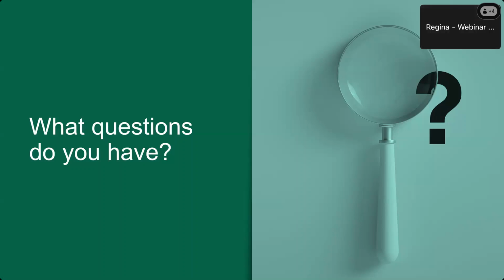Do you have any suggestions for mitigating PFAS contamination from the laboratory environment? That's a great question. We actually have a guide on our website called Mitigating PFAS Contamination in Your Lab. There is a lot of stuff, so I would urge you to go and take a look at it. I would defer to the very large white paper that we put together on the Waters site. There are so many different things that can contribute to the contamination, from specific types of makeup and creams, to clothing, to using aluminum foil, to cleaners used on the floors of the lab and everything. There are so many considerations to take. We could talk about that for a whole hour. Lab coats, everything.